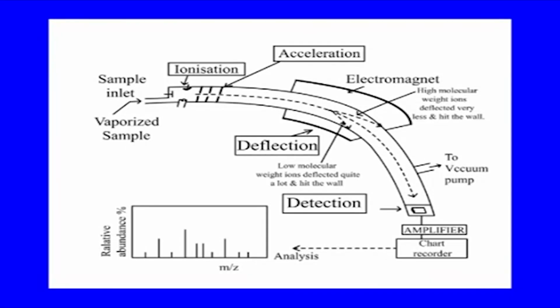If you see here, very simple, this is the sample inlet, and there is the ionization source.